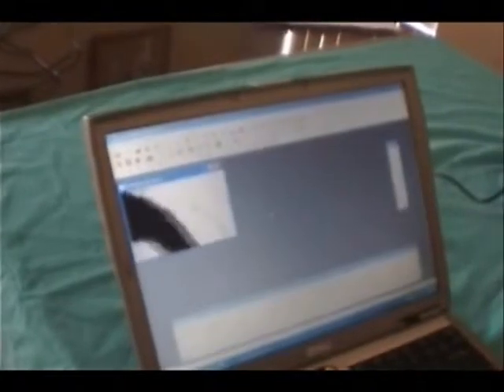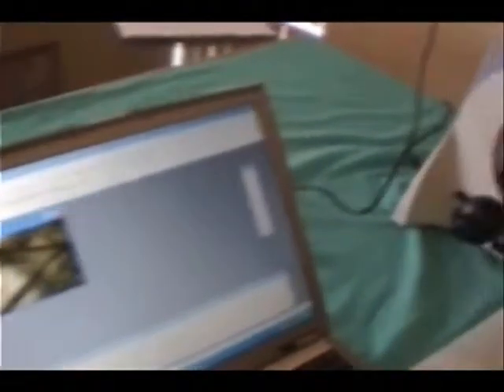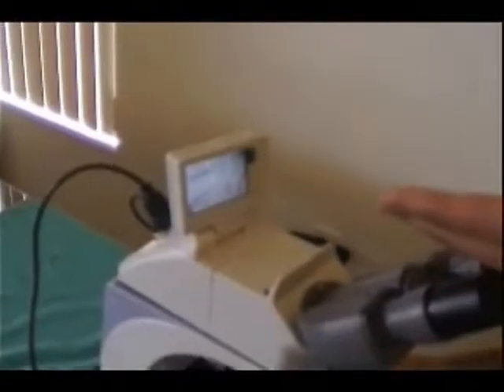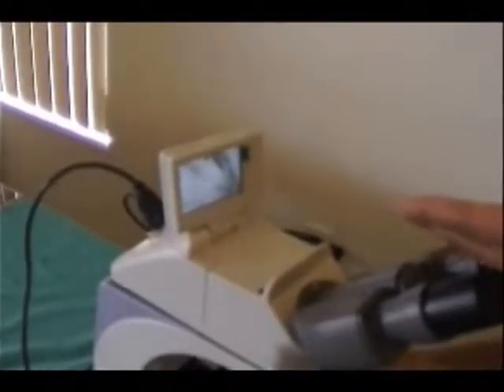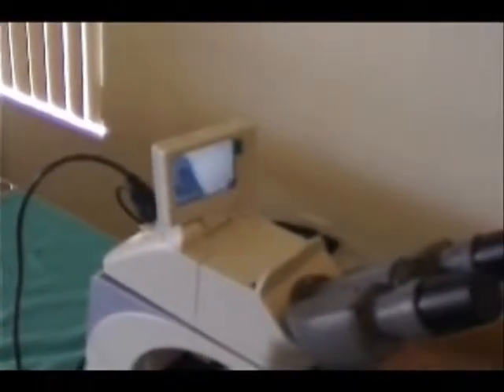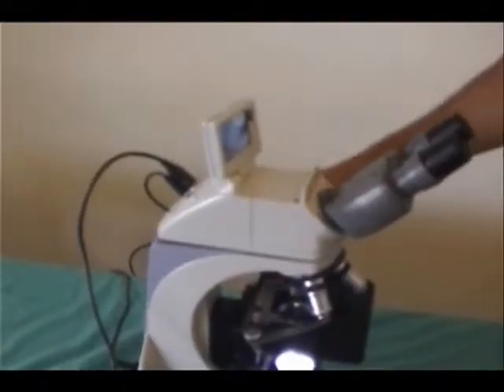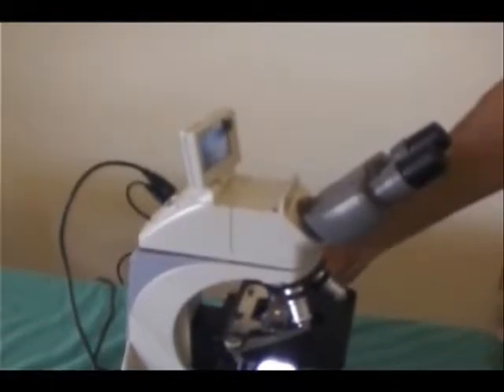Also, if you want to view it on the LCD screen, all you have to do is connect the USB over here to the EXT and now the image is actually on the LCD screen and it's also a live image. As you can see, the image is moving. This is a great technology and a great learning tool that can be used either in the classroom or in the laboratory.